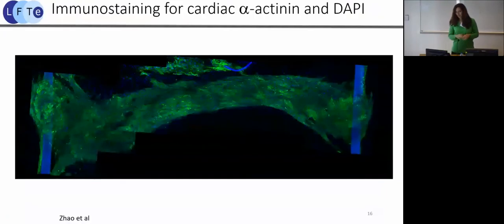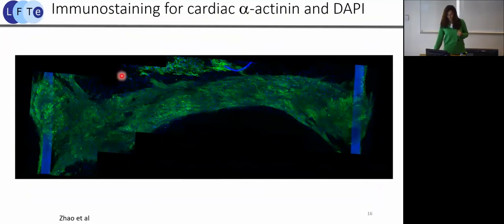And by measuring deflection using image processing, you can actually figure out force of contraction using either calibration curves that you can create for the wire, or if the displacement is very small, you can use beam bending theory and it will accurately assess force within small displacements. And at the end of the cultivation process, we now have tissue that is made of cardiomyocytes that are going from one end to another, spanning nicely around these wires.